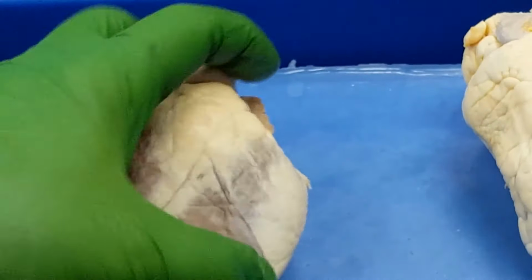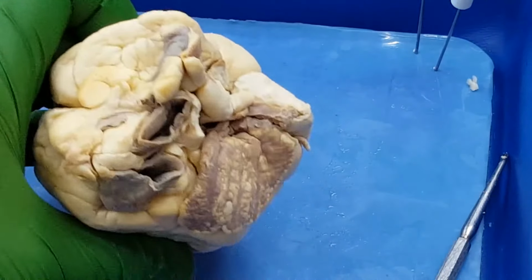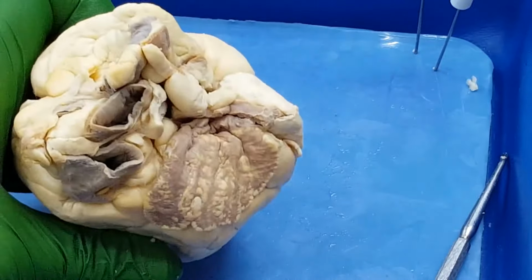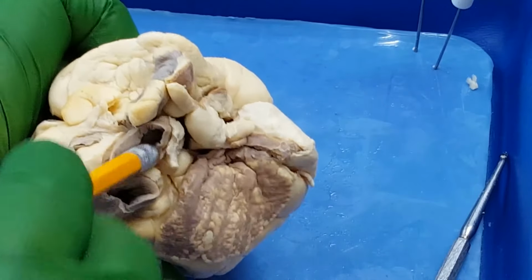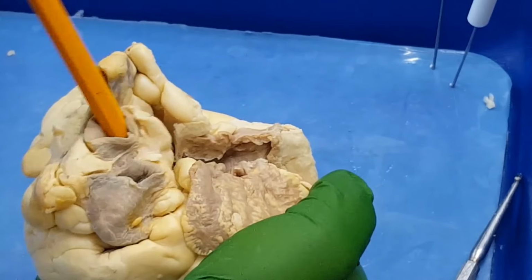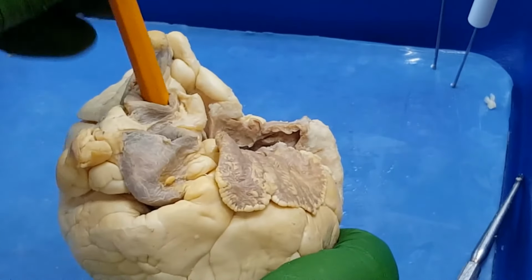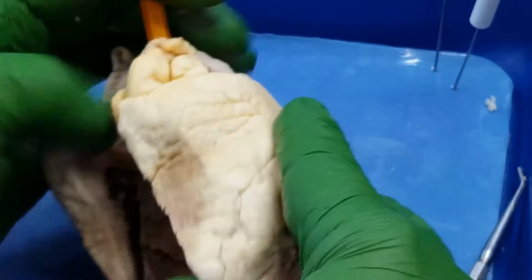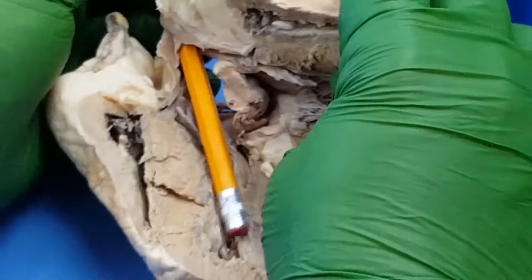Let's try it on the larger heart, shall we? Same idea. So I look at these great vessels on the back. I have a pretty good idea that this one right here is the aorta, but I'm not positive until I cram a pencil down there. Now, watch what happens as I stick the pencil into this thing. Notice how it is forced to skew left, which it just did. Going down into what, everybody? The left ventricle, right into the left ventricle.